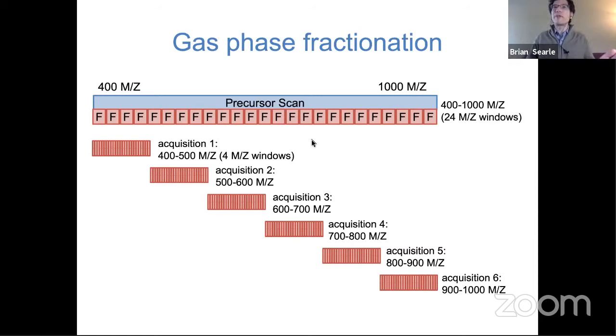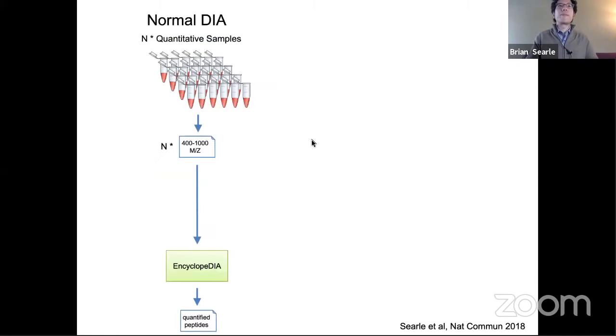So it's an extremely rich type of data where it's easy to detect peptides, it's easy to monitor peptides. So this would be way too expensive from an instrumentation perspective to do for every one of our quantitative samples. But we've started to do this for generating libraries.